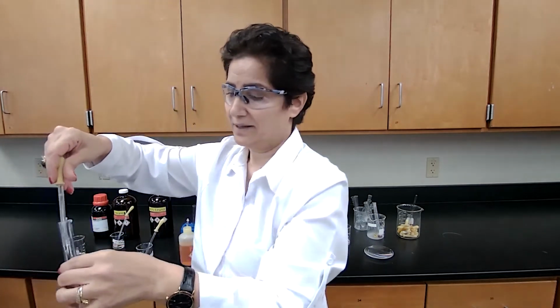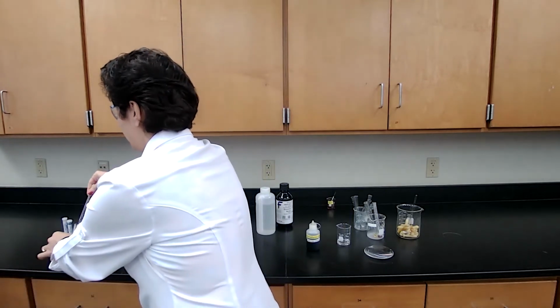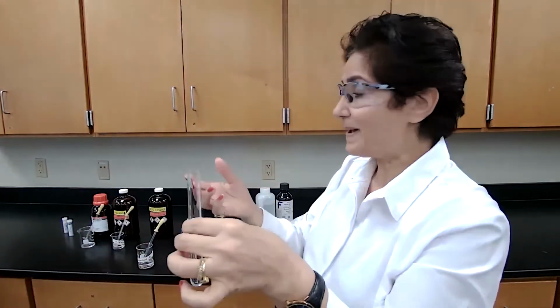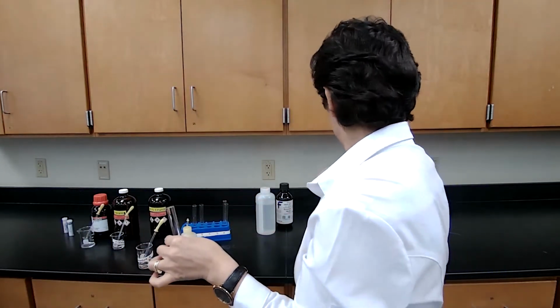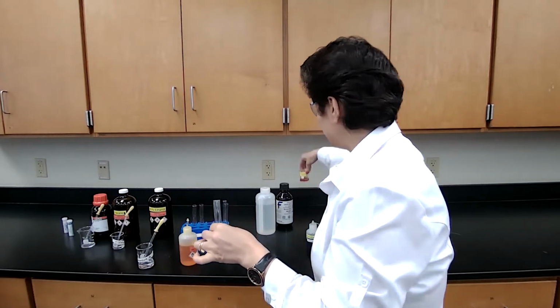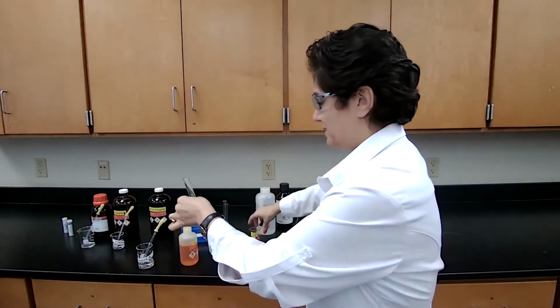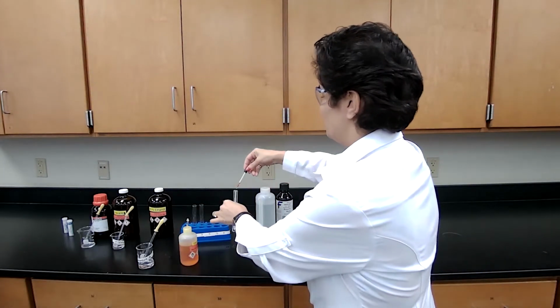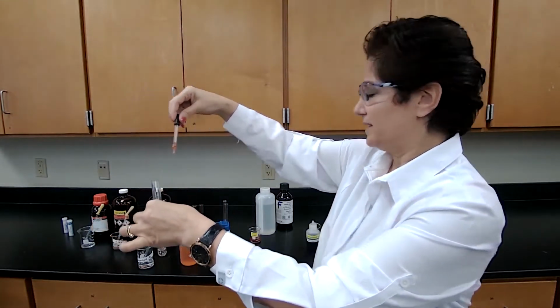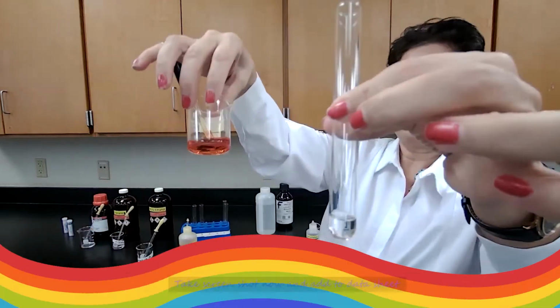I'm going to start with pentene. The first test is pentene. Pentene is unsaturated and is expected to have a positive test with the bromine. This is the bromine water, and it's not the most gentle chemical, so I'm just going to add one drop quickly and look for disappearance of the red color.